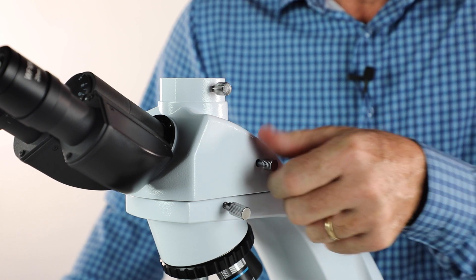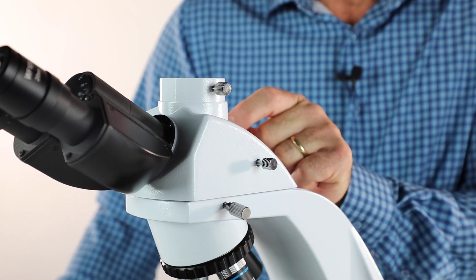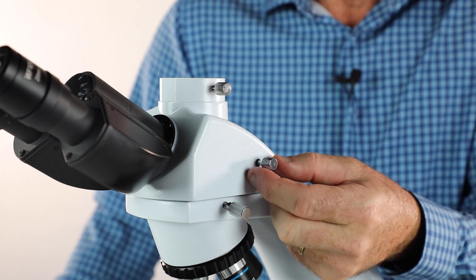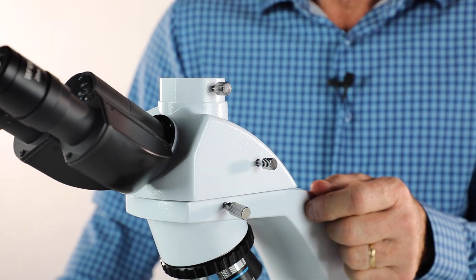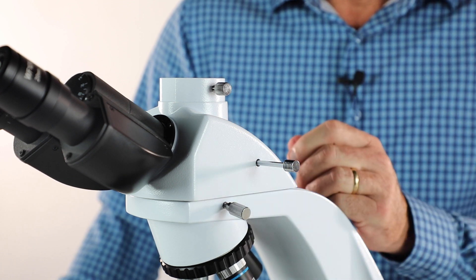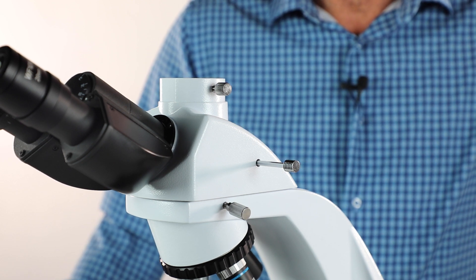Once it's tight, you can pull the rod. What's happening is the prism to the left inside the head is now moving to the center. Pull it out and the prism is in the center, so light will be coming up to the camera. If it's left in, the camera will be in darkness. You can leave the rod out the entire time you're using the microscope with your camera.